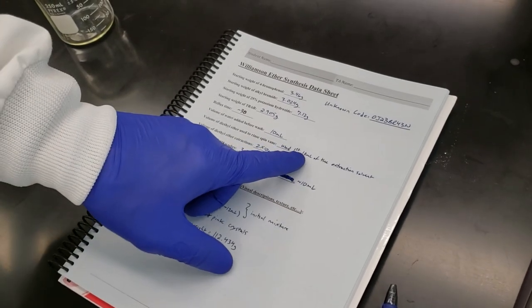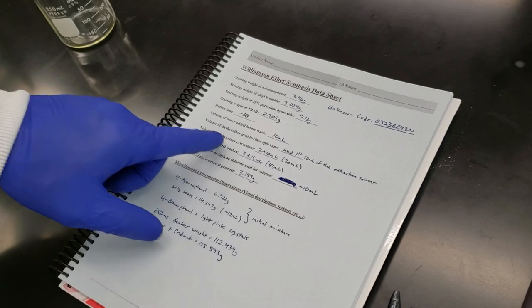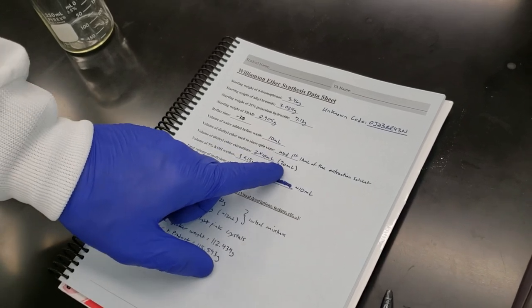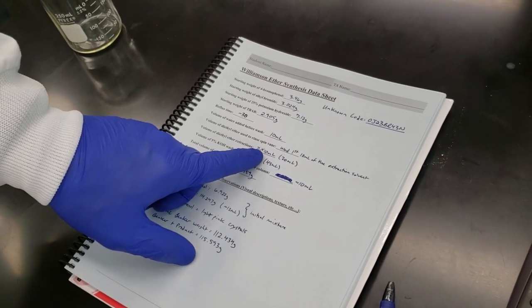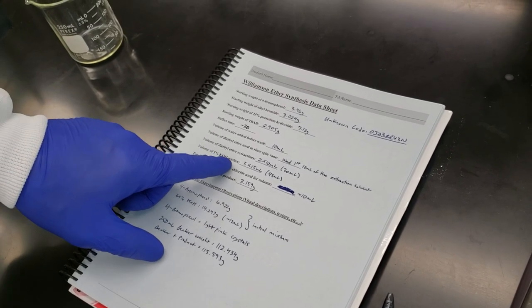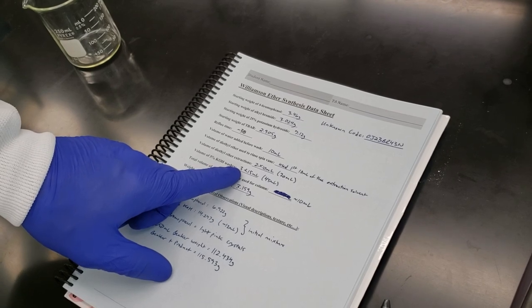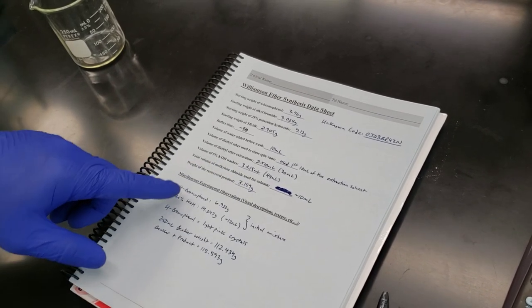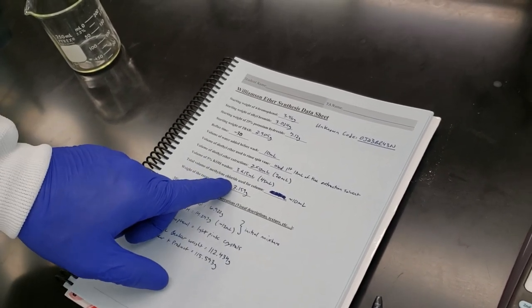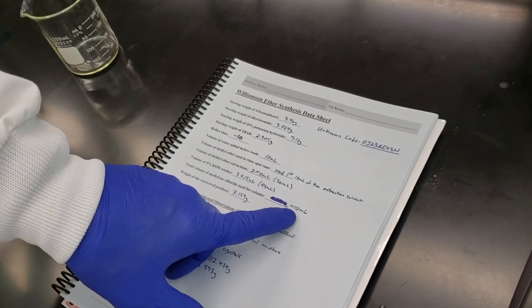We actually just used the first 10 mil portion of the extraction solvent. The total volume of our diethyl ether extractions was 20 mils. That's 2 times 10 mil portions. The total volume of our 5% KOH washes was 45 milliliters. That's 3 15 mil portions. Total volume of the methylene chloride that we used to rinse our product through the column was approximately 10 milliliters.